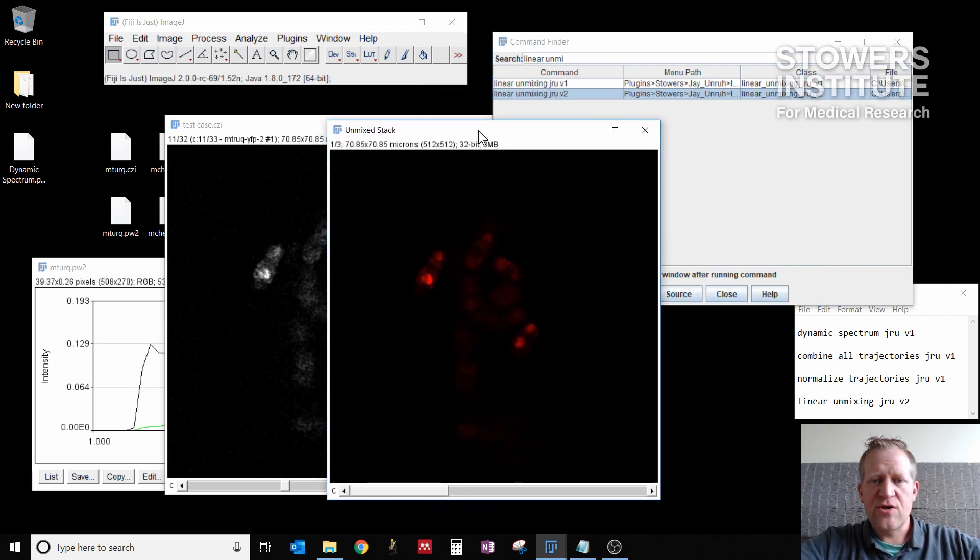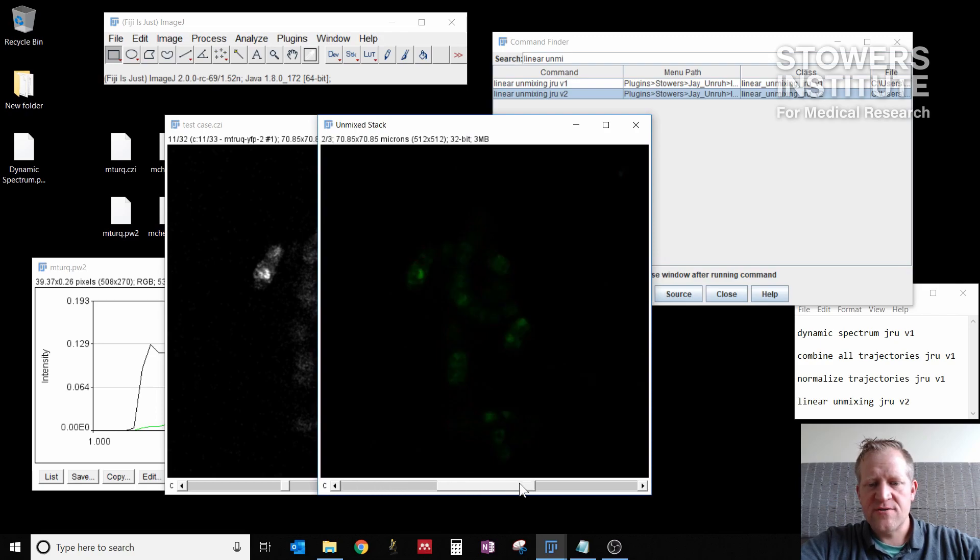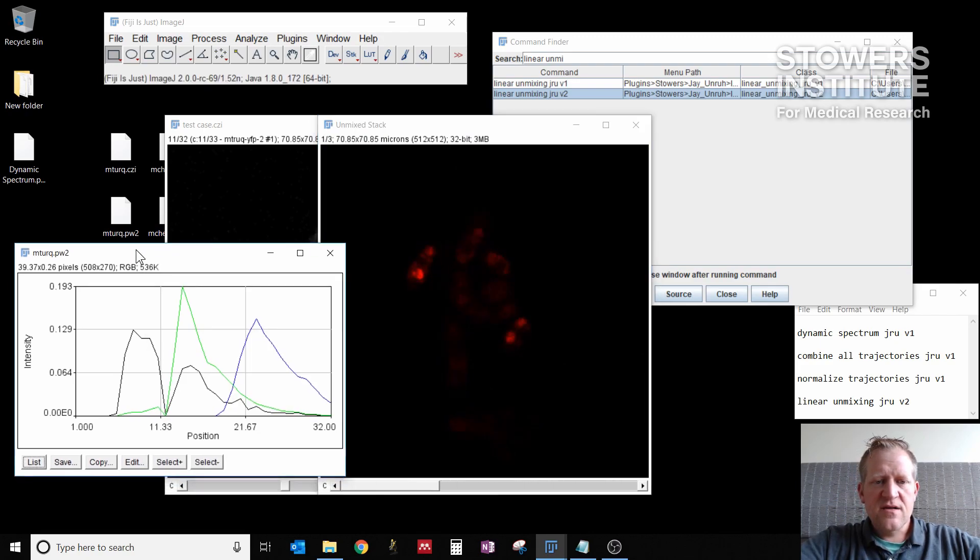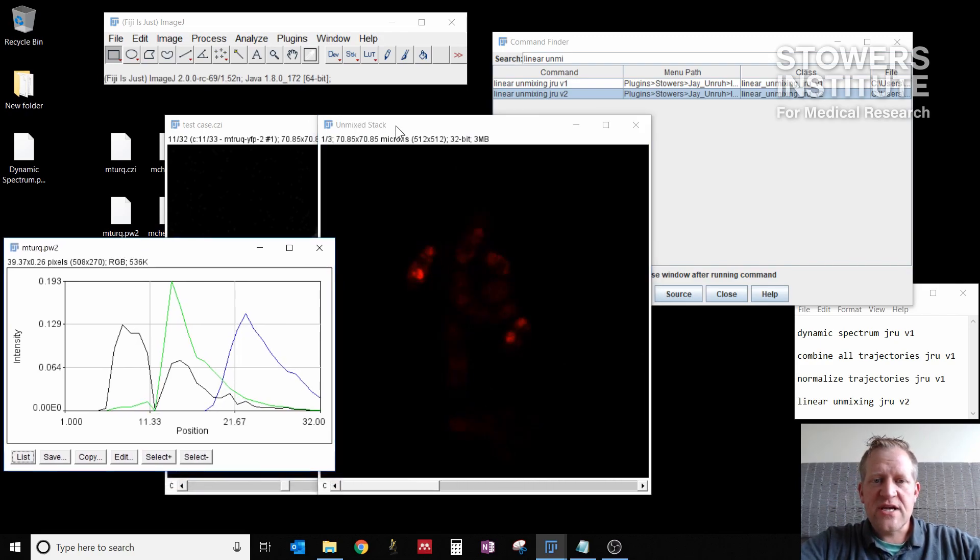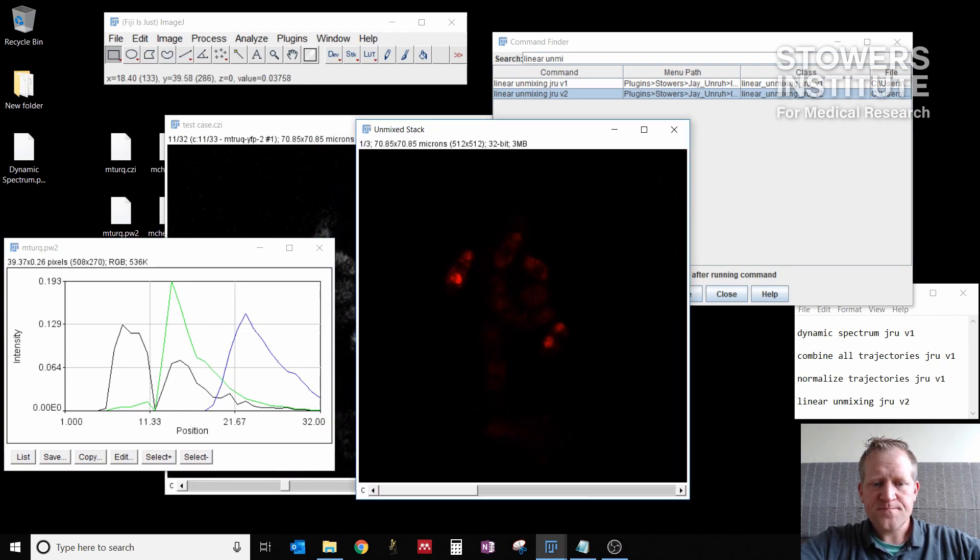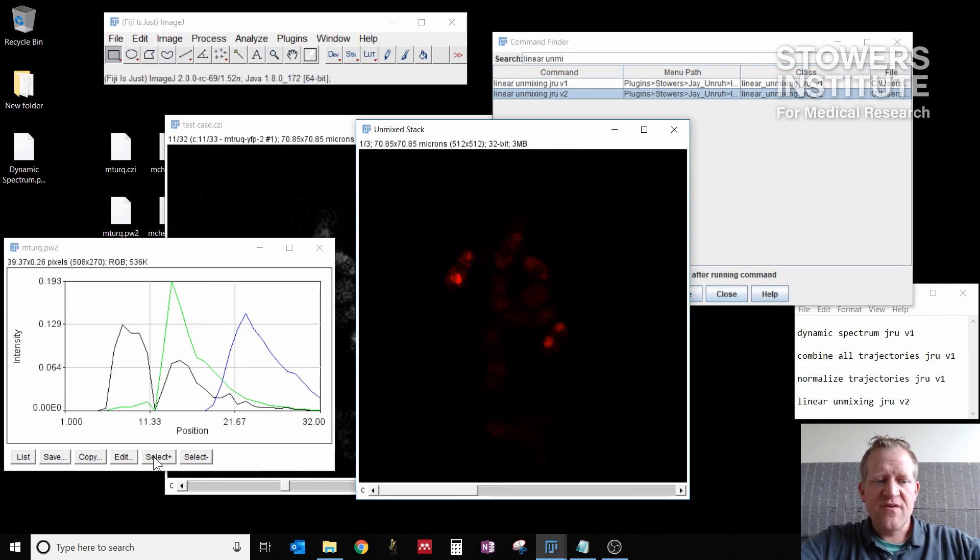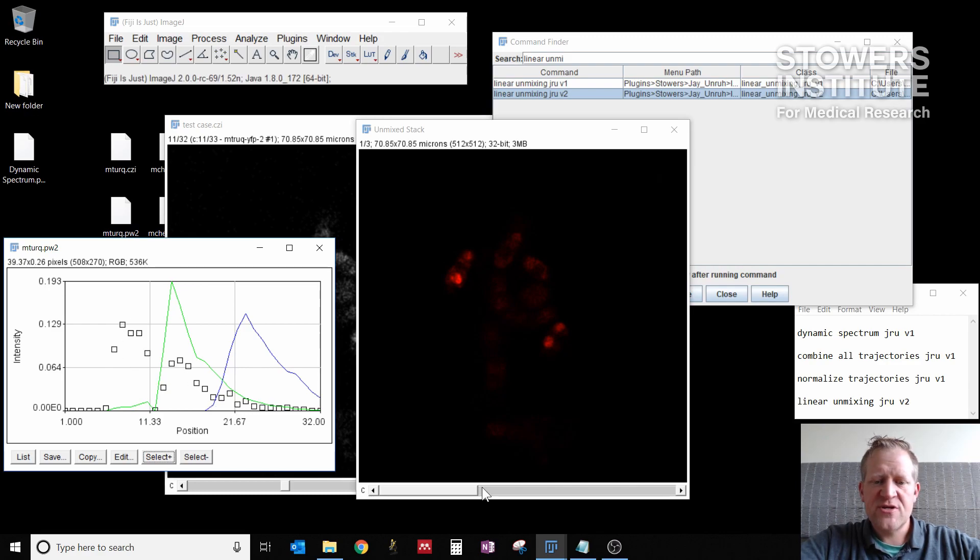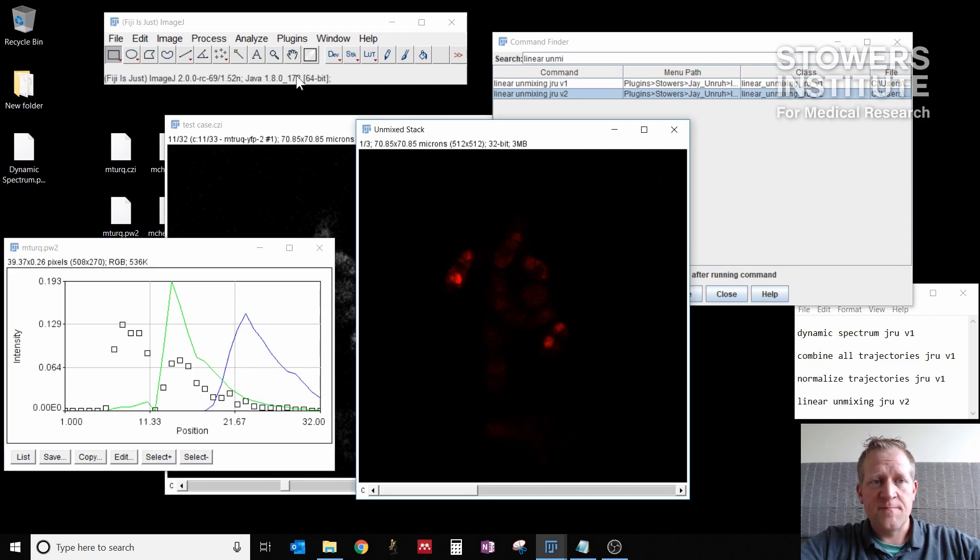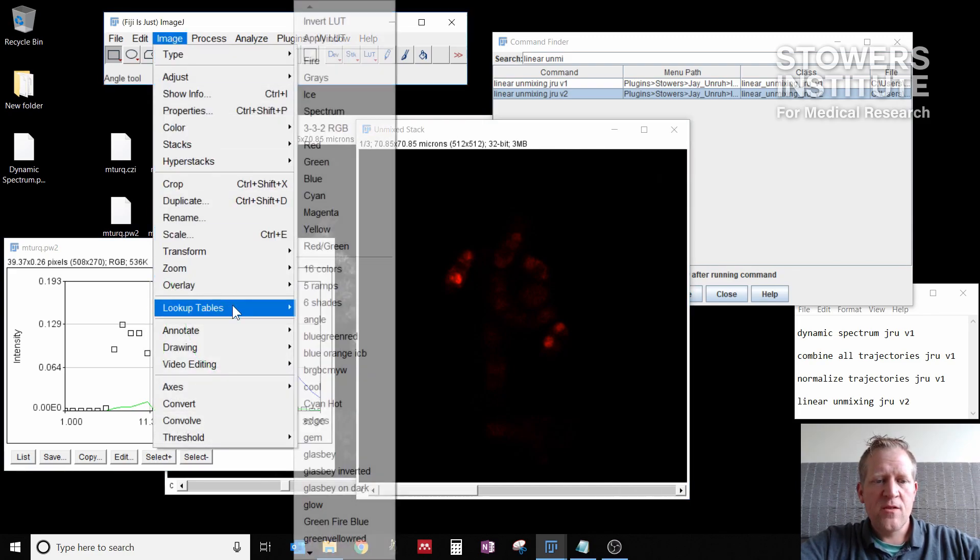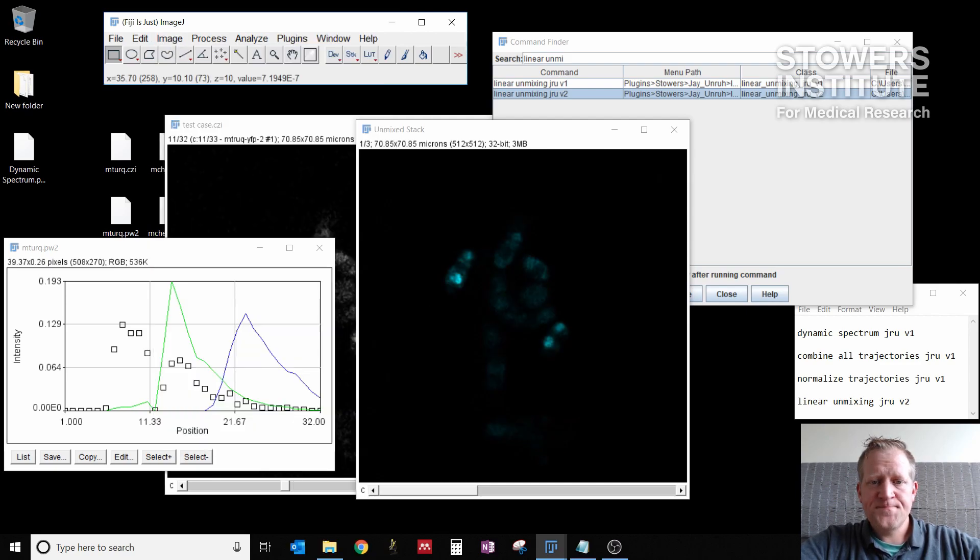I now get a new image out. That's a channel image. You notice it only has three channels. The color of the channels is completely arbitrary. So you need to go back to your plot window to figure out which channel is which. If I click the select plus button, you'll notice that I get this spectra selected first. And that's my mTurk spectra. So channel one in this image should be CFP. So I can go to image, lookup tables, cyan.